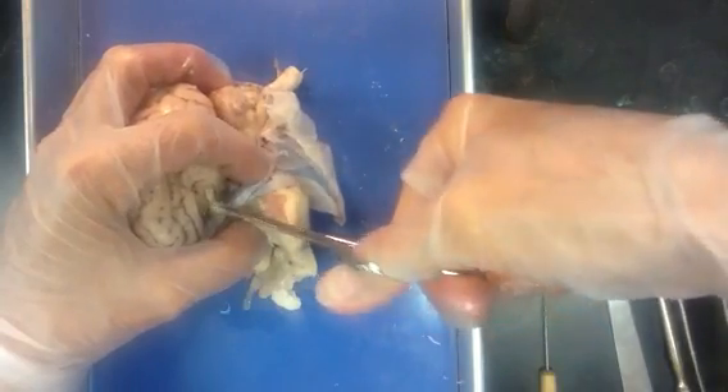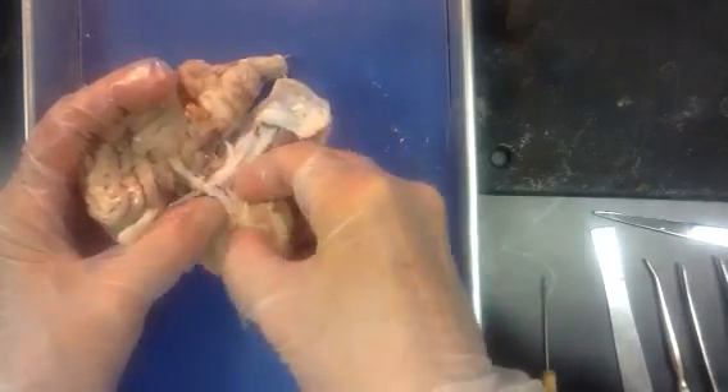Of course, we're dealing with a dead brain, but imagine if this were alive — the responsibility. Oh, my goodness.